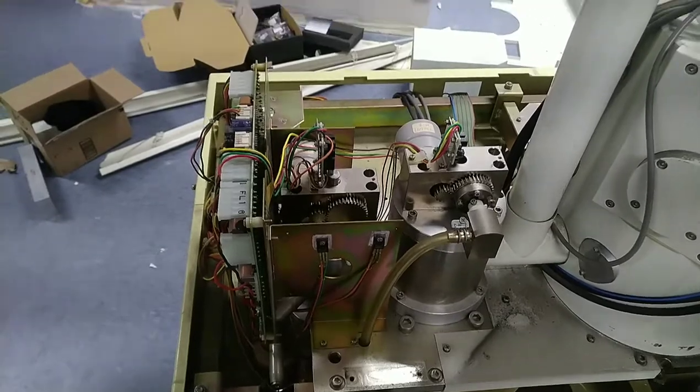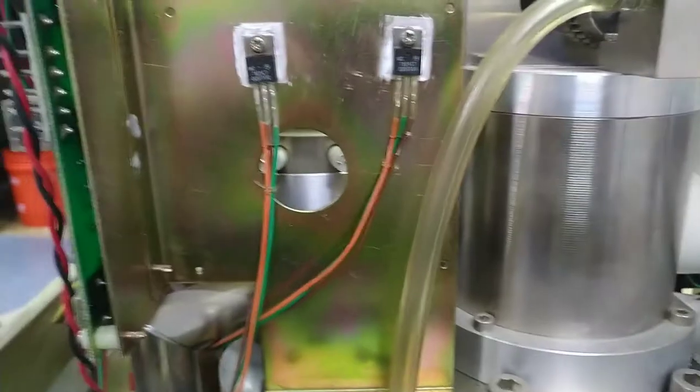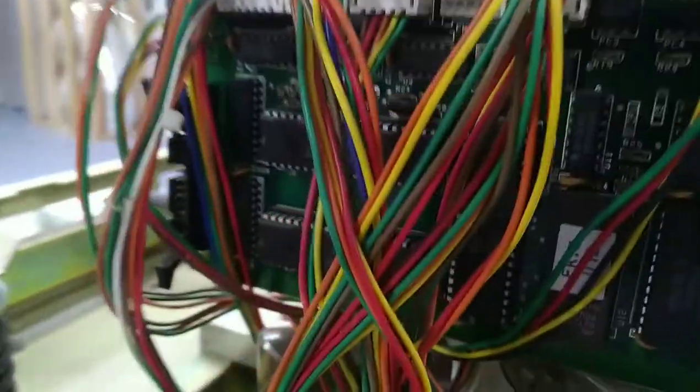I think it's a gift that just keeps on giving. I have no idea what these motorized valves are for or what they do, or what this entire circuit board is for.